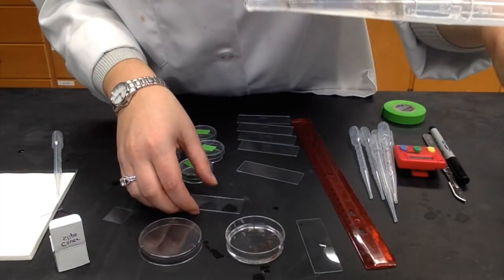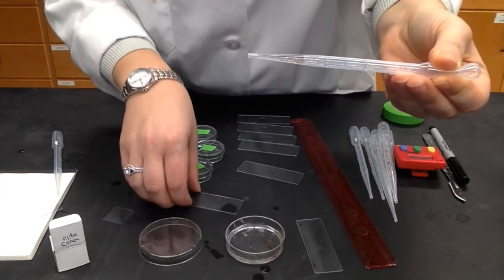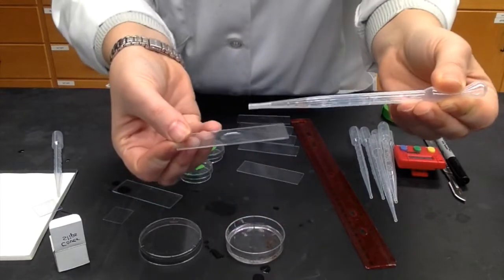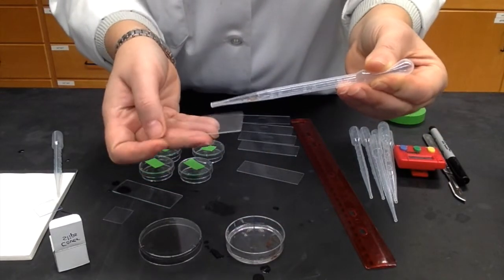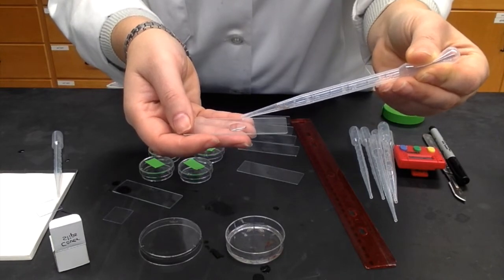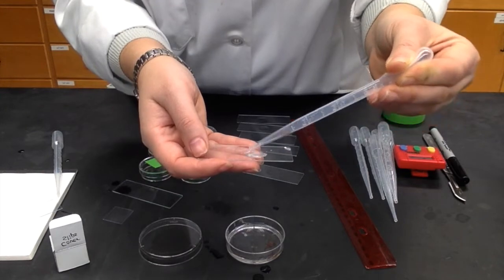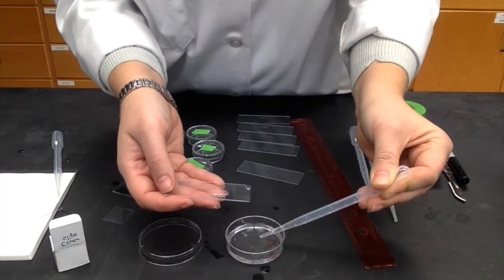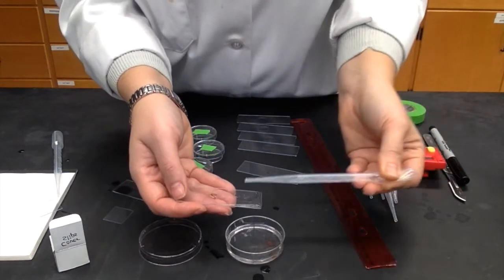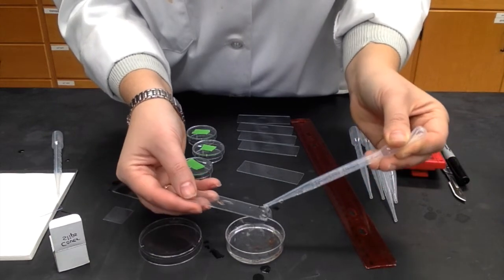Here you can see there's 2 worms in this transfer pipette. Simply press out 1 worm onto your slide. Removing the excess water will make it easier for you to chase down your worm. So once you've gotten the excess water out, squeeze out your worm onto the depression slide, or onto the flat slide, excuse me. If you squeeze out more than 1 worm, it's okay. Just wash the other worm into the tray.